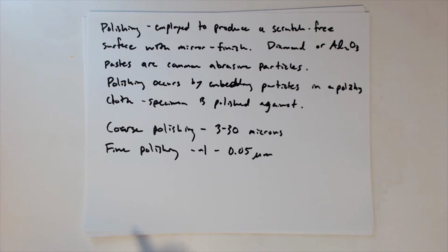All right, so some notes here about polishing. So again, you could do this by hand if you wanted. Most likely this is going to be a polishing wheel, the same mechanism we saw with grinding, but instead of that grit paper, we have a cloth that we put that slurry in. We typically don't press too hard. If we press too hard, we can actually form plastic deformation, so those particles can deform the top layer. So we want to avoid that, so very light pressure.